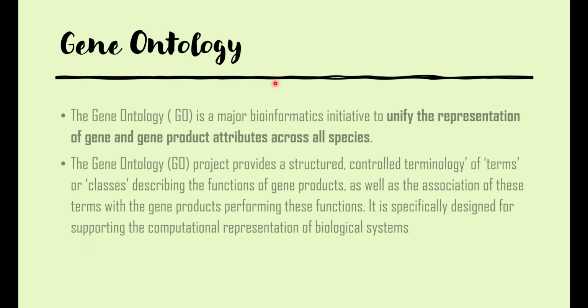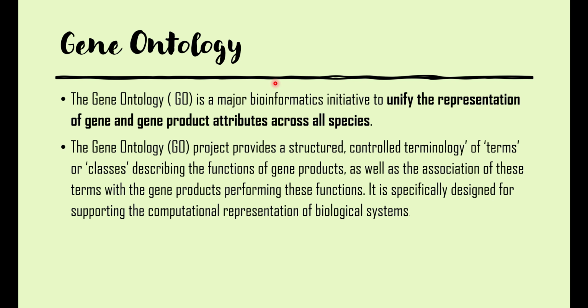Before proceeding to the tool demo, we should know what gene ontology means. Gene ontology is a major bioinformatics initiative to unify the representation of gene and gene product attributes across all species. It basically focuses on connecting gene functions and expressions across all species.